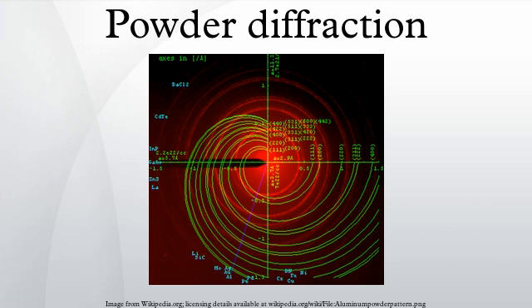Neutron diffraction has never been an in-house technique because it requires the availability of an intense neutron beam only available at a nuclear reactor or spallation source. Typically, the available neutron flux, and the weak interaction between neutrons and matter, require relatively large samples.